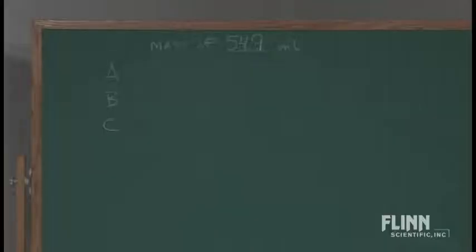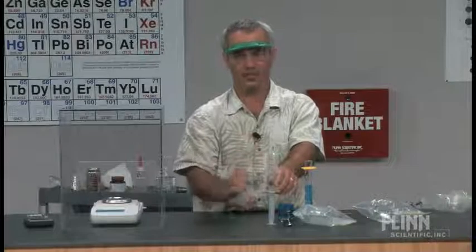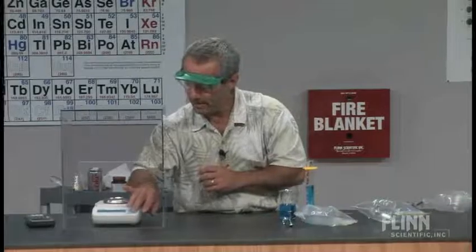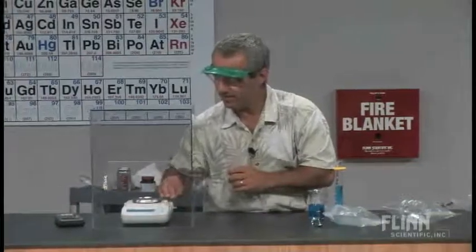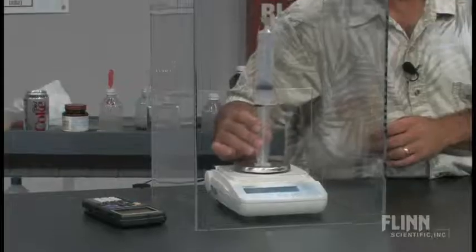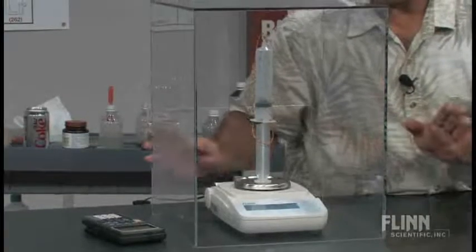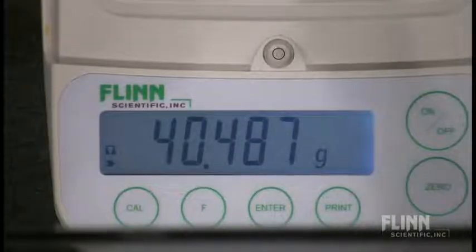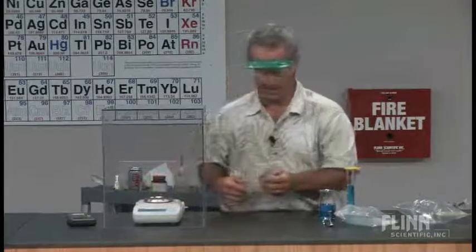Now of course we have to weigh the syringe. This will not work on a regular centigram balance. You won't get enough precision. So I go to a milligram balance. I've got one set up here. Let me zero it first. And put this on there. We're going to write down this mass of the syringe, 40.486 grams.